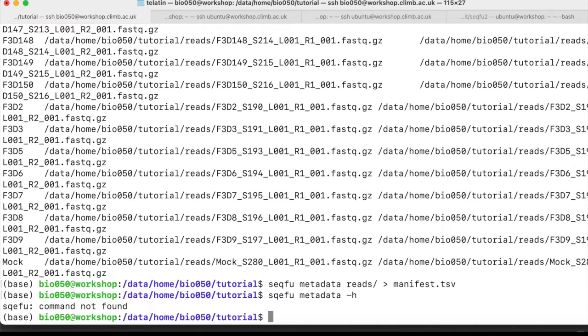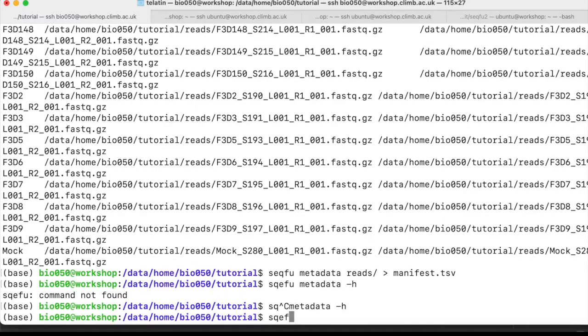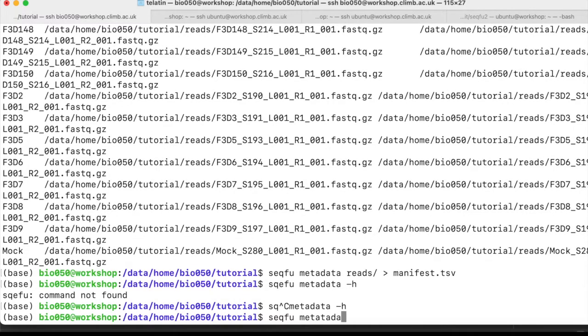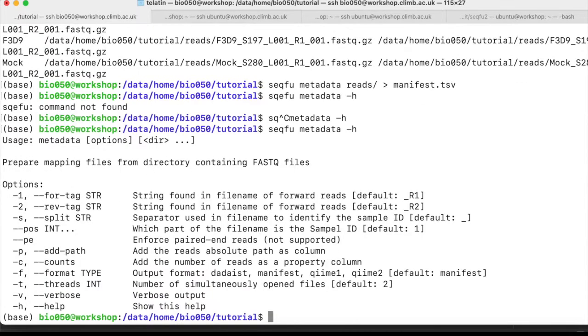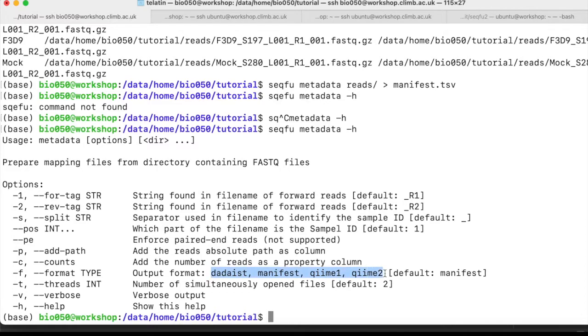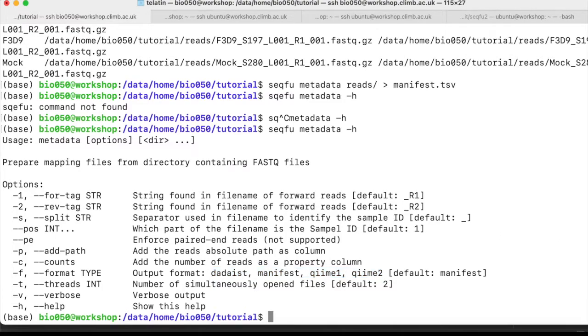Seqfu metadata can also be used to create blank QIIME qiimelist, or QIIME1, or Lotus.